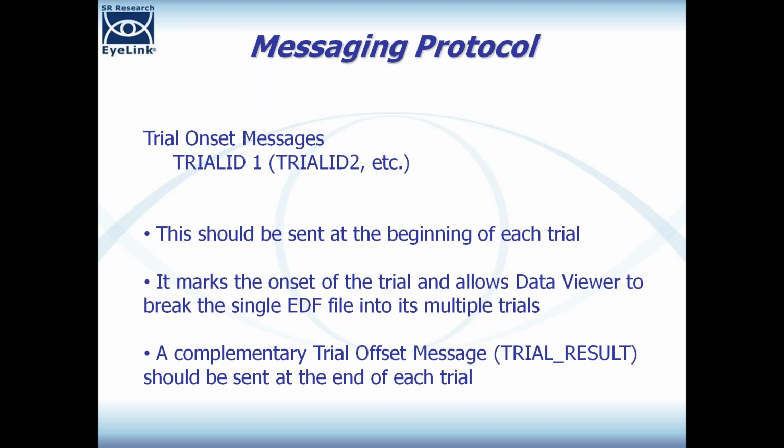This should be sent at the beginning of the trial. It marks the onset of the trial, and it allows Data Viewer to break that single EDF file into multiple trials. There's another message that's sent at the end of the trial, which we'll come back to, that marks the end of the trial.